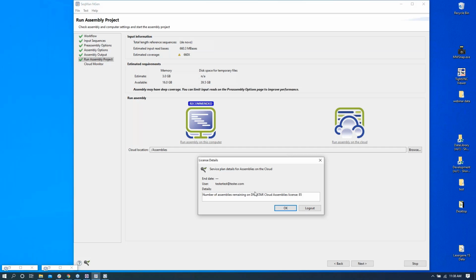During the upload, there is compression of the files. So if you're uploading directly from that 4 gig RAM computer, it will use your CPU as it's zipping those files. So that would be the only limiting factor. If you had huge numbers or gigantic FASTQ files, it'll use your CPU a while. Other than that, it should be fine.